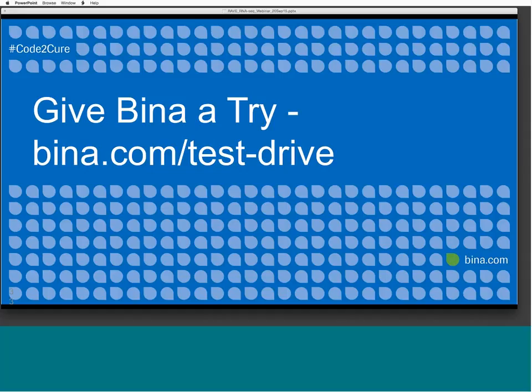So I have a question asking: the example I gave was 100 base pair reads with 200 million reads. However, in our lab, the RNA-Seq data is 75 base pairs with 30 million reads. Do you think this is a big issue? It depends on what you're trying to detect. If the transcripts that you're interested in are low abundance, then you want higher coverage. But in general, the amount of data you have is about right for RNA-Seq. So it's not too big an issue.